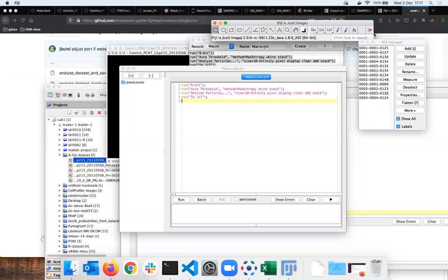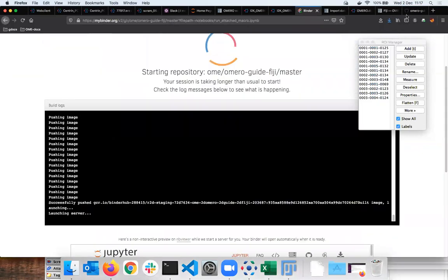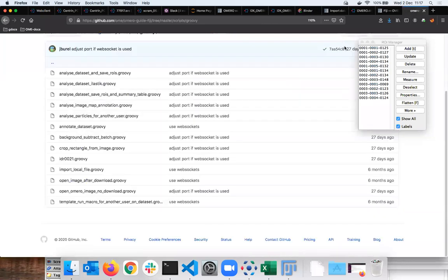tool elsewhere. And another advantage, and we have colleagues in Dundee that work that way, is they do analysis in one software. In that case, they were doing some tracking in Python. They save the result into OMERO, do the attachment, and do further analysis in R, but at least they have better control of where the analytical results end up.